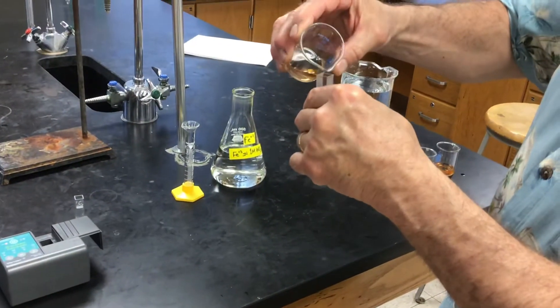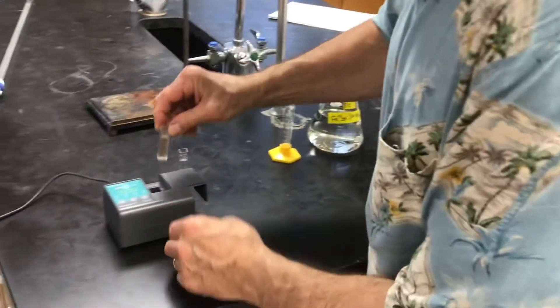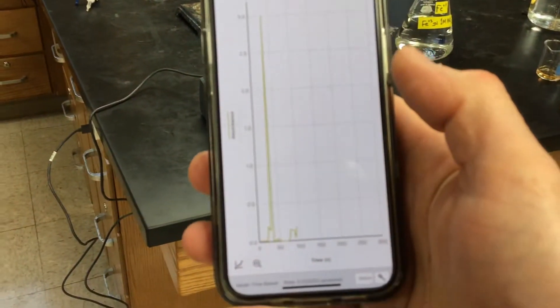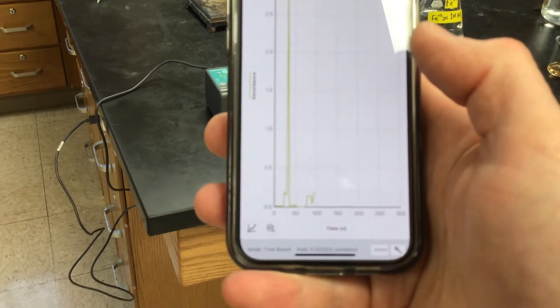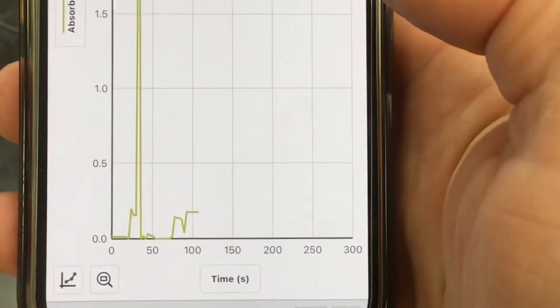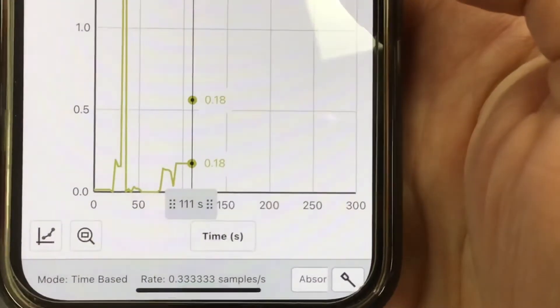So you want to do trial one? Okay. So here comes trial one. I will put some of the solution into the cuvette. We should read what the absorbance of light is. Let's let it figure out what it's going to be. And let's see if I can figure out how to get this to focus. Ah, there we go. Okay. So this tells us the absorbance is 0.18.